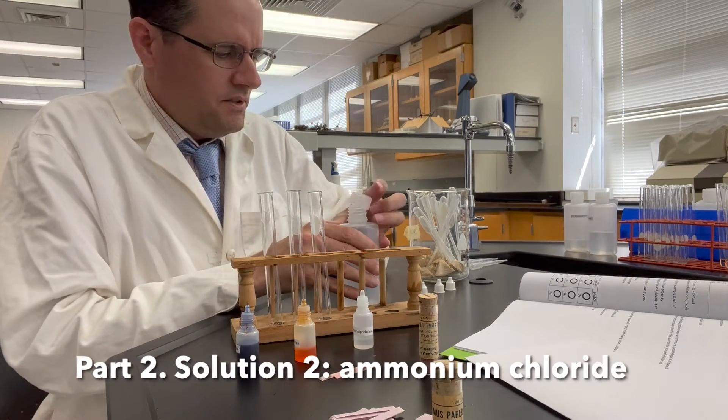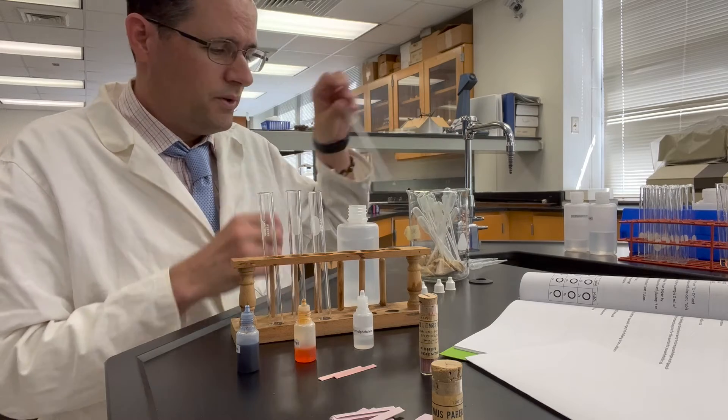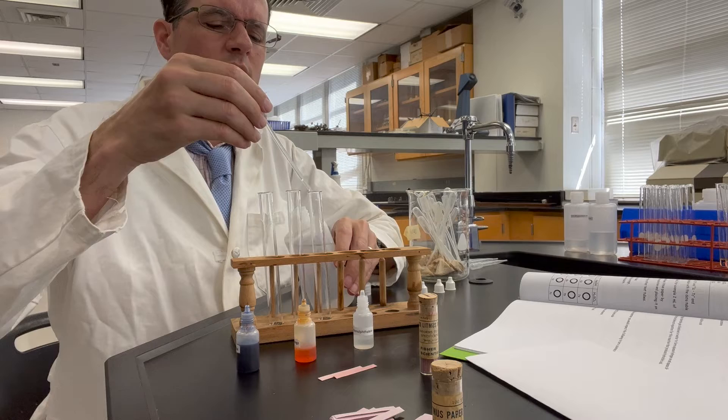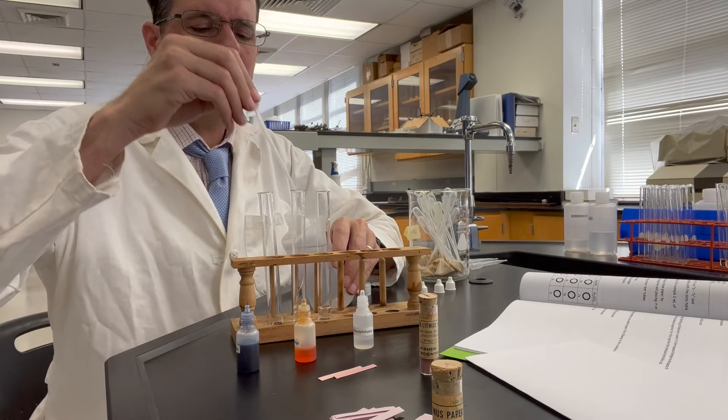This is part two, test tube 2A, 2B, and 2C. We're going to be adding 2 milliliters of 0.1 molar ammonium chloride to each one of these test tubes here.